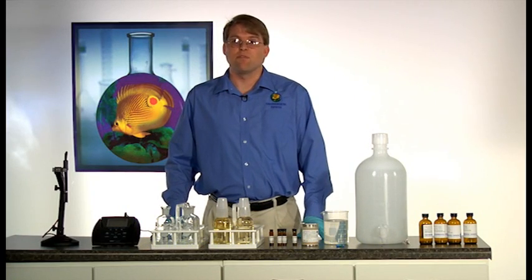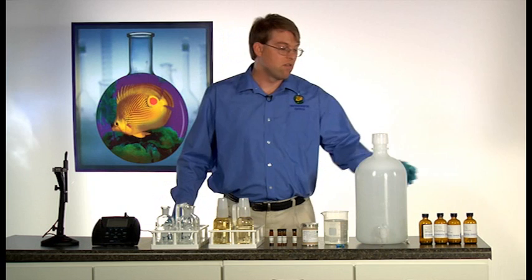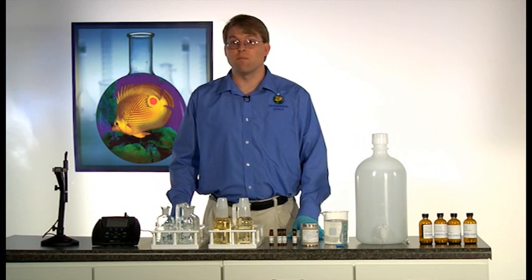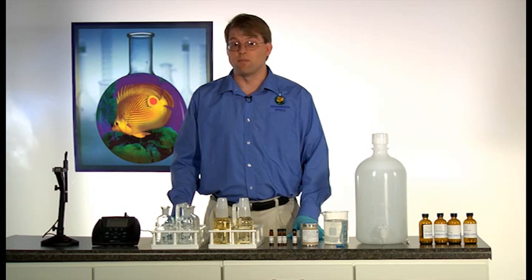Environmental Express provides everything you need for a successful BOD batch, from the dilution water reagents to the bottle. There is also a full line of incubators from 3 to 27 cubic feet available for use.